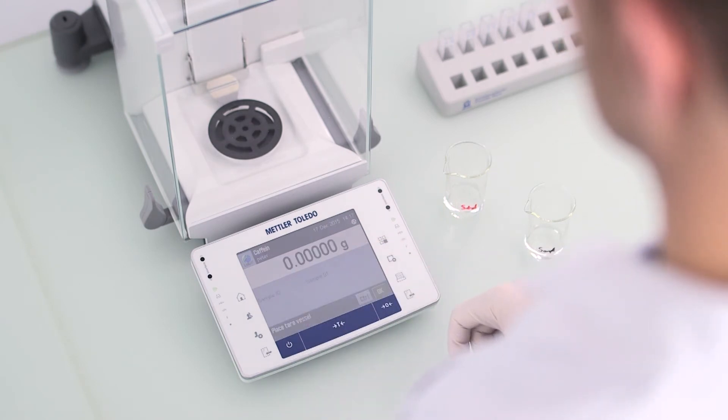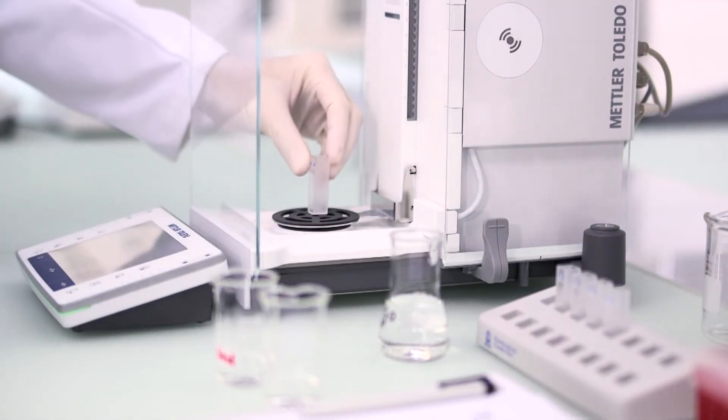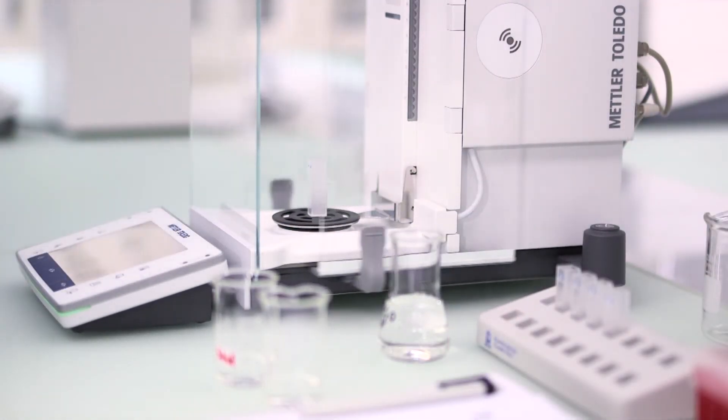User guidance on the touch screen of the instrument steps the user through the control process all the way through each step of the lab's SOP.